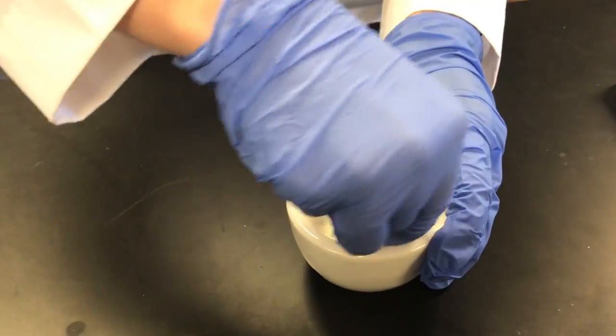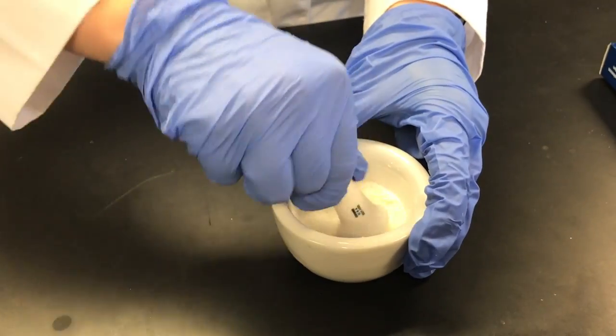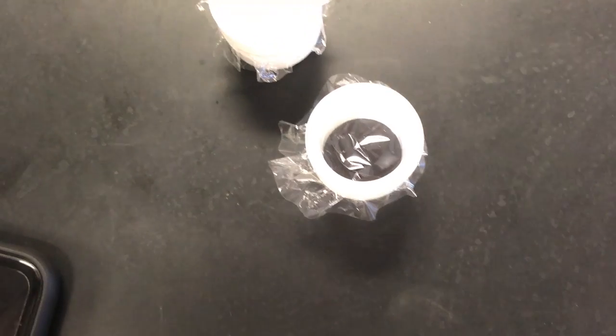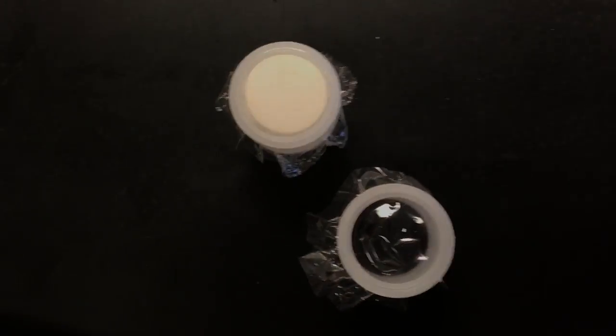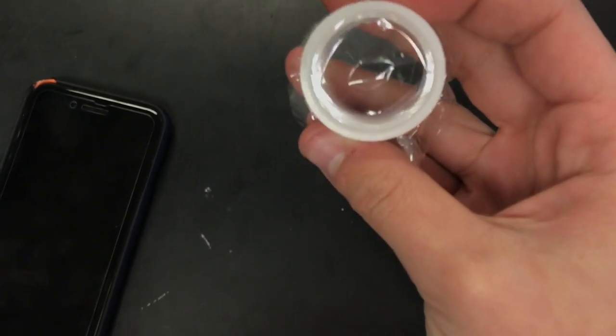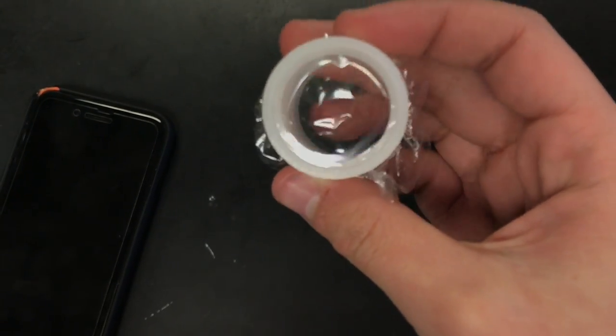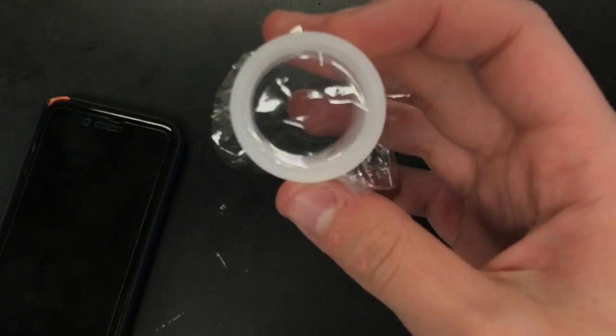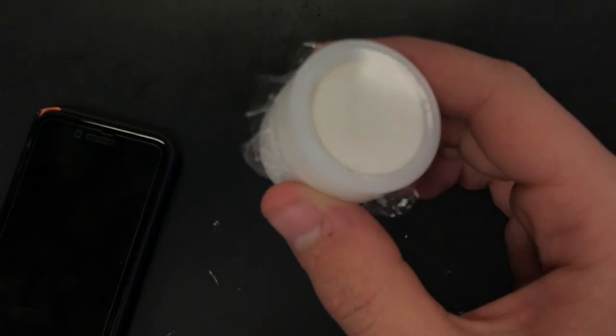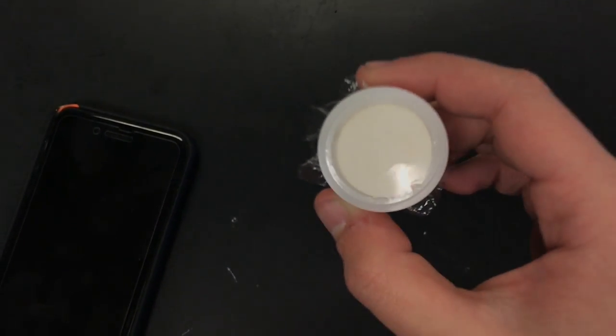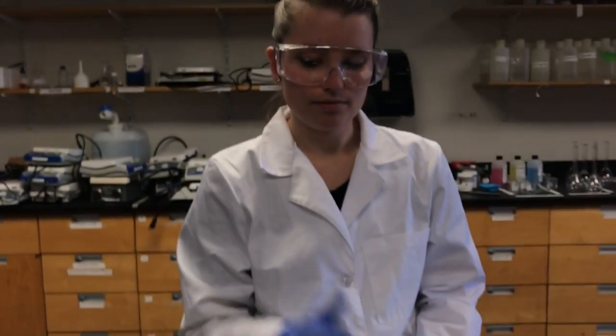Now we're going to show you how to assemble the XRF cup. Here is an example of a good and a bad XRF cup. As you can see on this one, the plastic isn't taut and it's very loose, and that will not give you a good reading, while on this one it's very tight and smooth. That's what you're looking for. Now Kristen is going to show you how to do that.